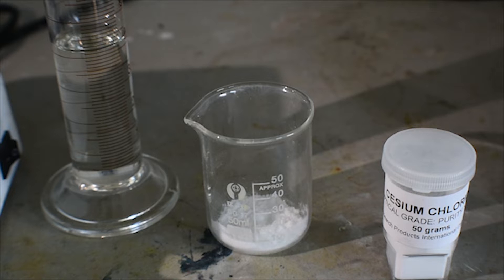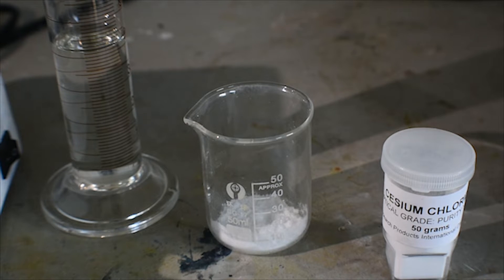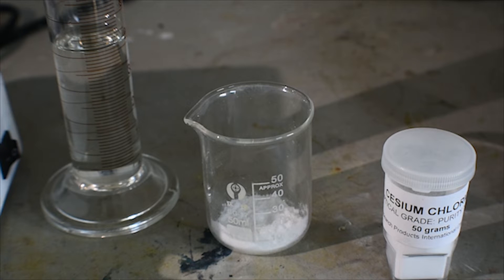I will then take the potassium tetrachloroiodate that's produced and react it in a double displacement reaction with cesium chloride. This will produce potassium chloride and cesium tetrachloroiodate, which is considerably more stable than potassium tetrachloroiodate, the latter releasing iodine trichloride as it decomposes at room temperature. Cesium tetrachloroiodate is stable in storage and does not evolve iodine trichloride and can be kept for a very long time without significant decomposition.